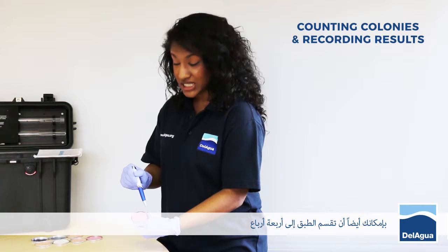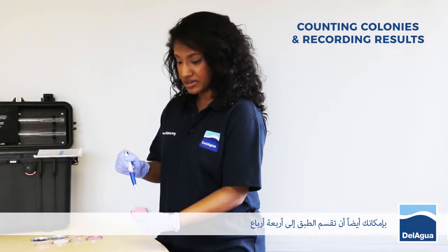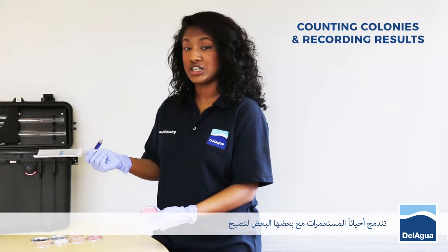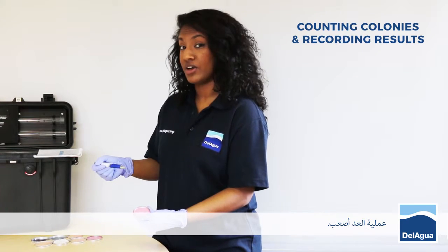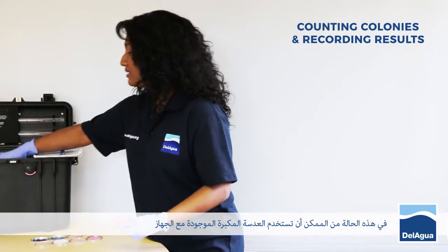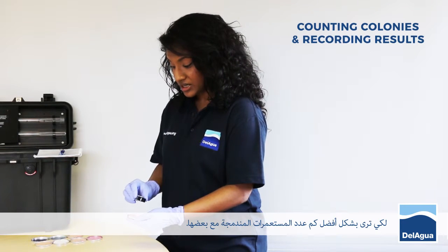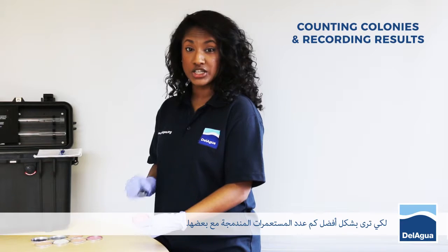Alternatively, you can actually split the plate into 4 quadrants and then count each quadrant individually. Sometimes colonies can actually merge together, making it difficult to count. If this is the case, you could use the hand lens supplied with the kit and use this to zoom in and decipher how many have actually merged together.